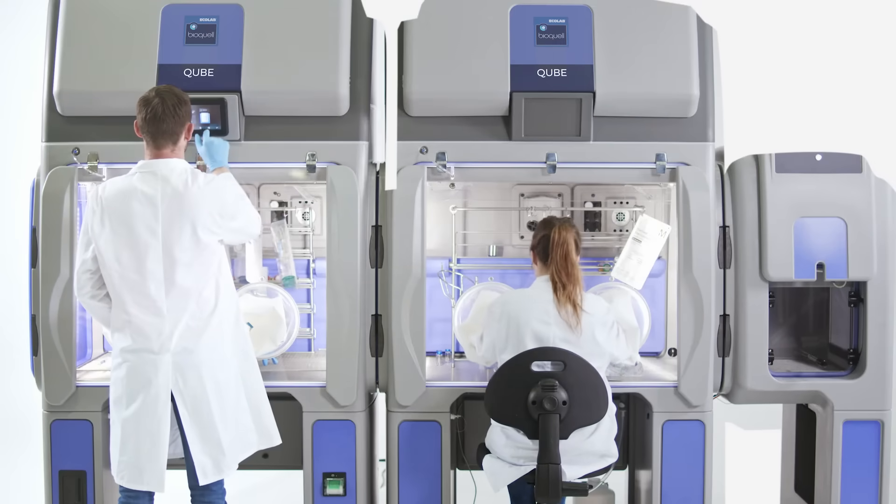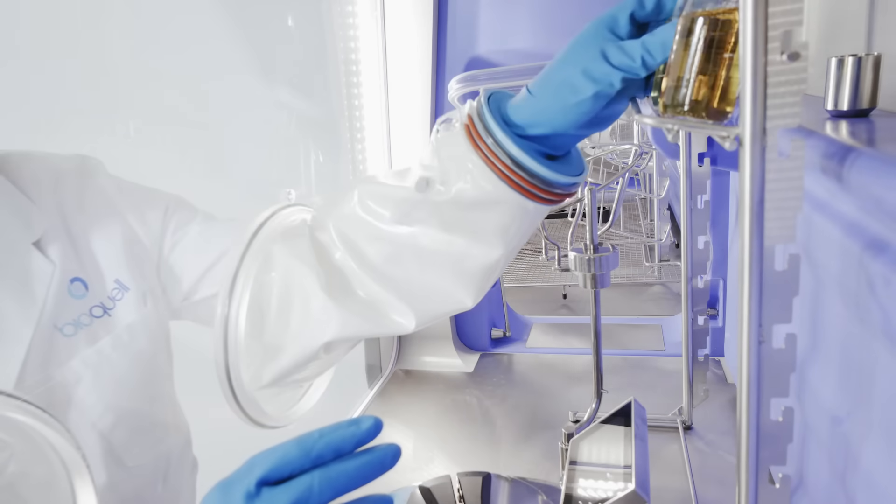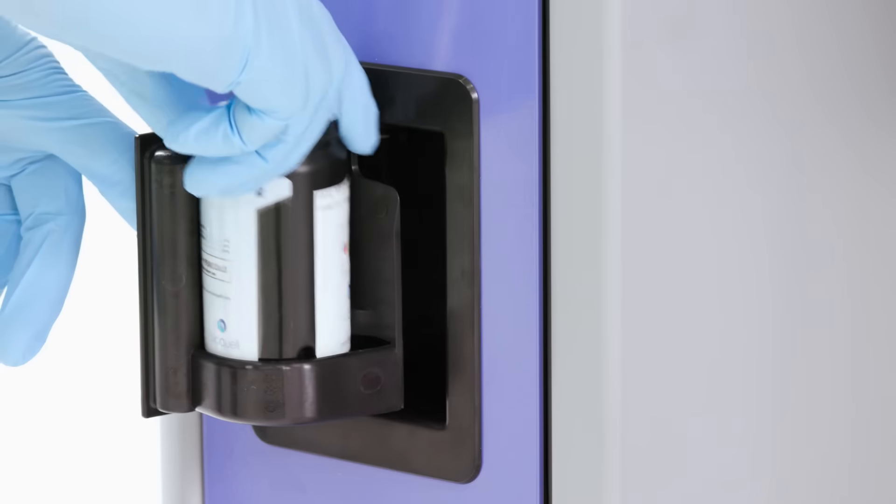Globally accepted, with hundreds of chambers currently installed and in use with world leaders in biopharmaceutical, laboratory research and biotechnology.